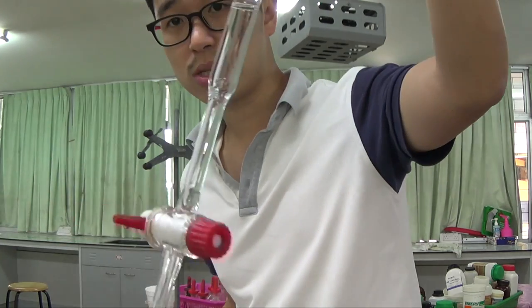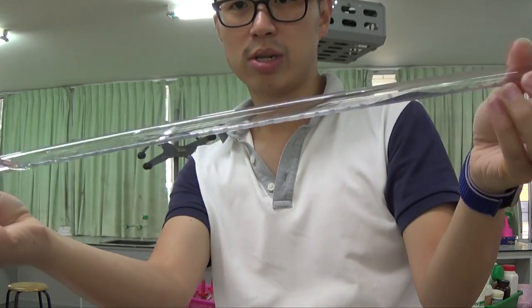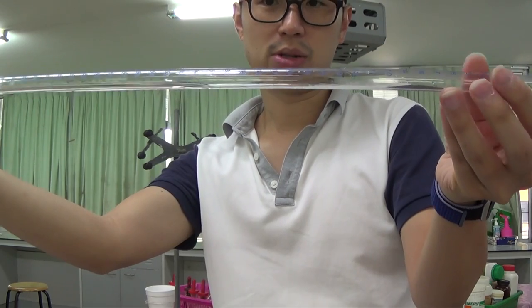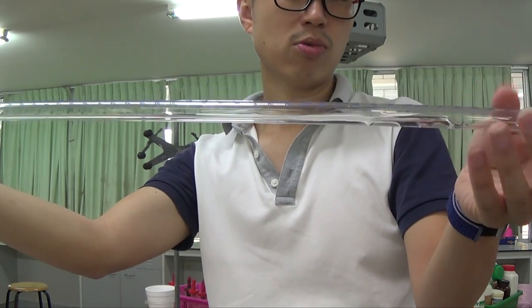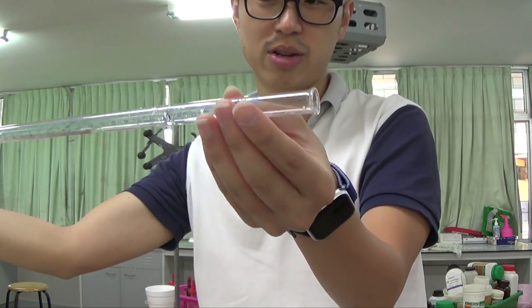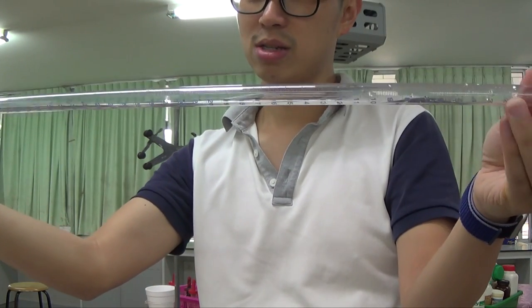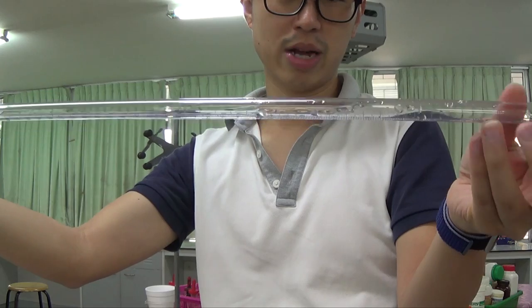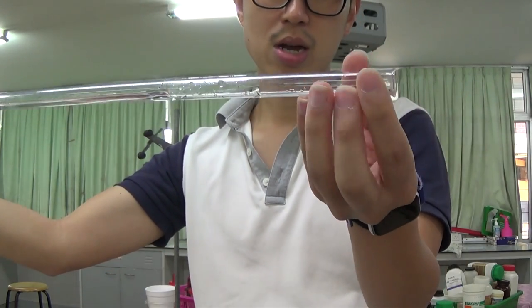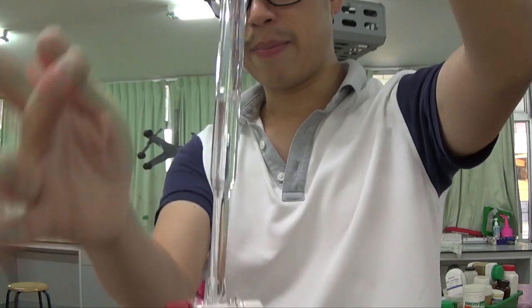So I'm just doing rinsing, so I just fill it in a little bit. My tap is still closed, so what I'll do is I will swirl around the side so that you can see the liquid flowing onto the upper part. So I'm trying to wash as much of the side as possible, but I don't want to spill it onto the ground, because slippery ground is very, very dangerous in the lab, and you're not supposed to spill anything in the lab, not onto the ground at least. So what I'm doing is I'm rolling the burette so that the liquid is slowly rinsing the side, and now it's coming back down again.